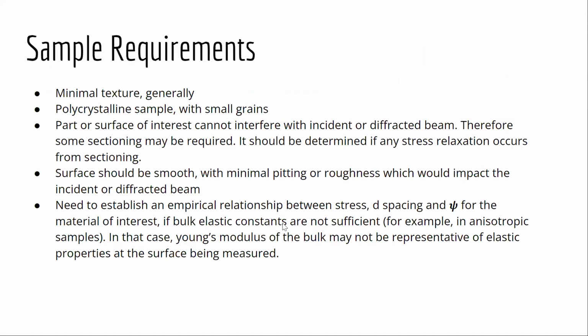Some additional information on sample requirements. Typically, you'll need minimal texture, and it'll be a polycrystalline sample with small grains. The surface of interest can't interfere with the incident or diffracted beam, therefore some sectioning may be required. And something you need to consider with that is if by cutting your sample, you'll be introducing any stress relaxation. Ideally, your surface will be smooth with minimal pitting.